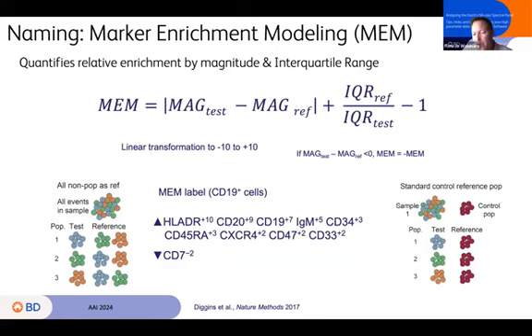I really like the approach of factoring in that this is biology, and it's a world where dim exists, and bright, but not as bright as that thing, all that kind of stuff. So negative 10 to 10, there's this other factor here where the interquartile range, a ratio of the reference versus the test, is factored in. That's just to figure out if there's a really messy population, just a big spread with a huge interquartile range, we just don't want to trust it as much.